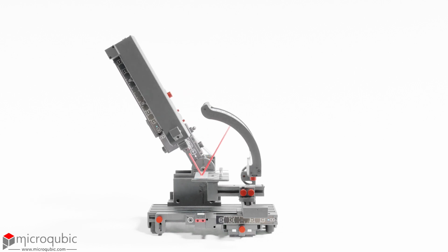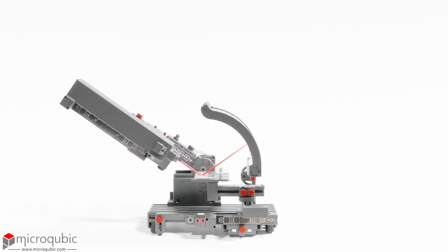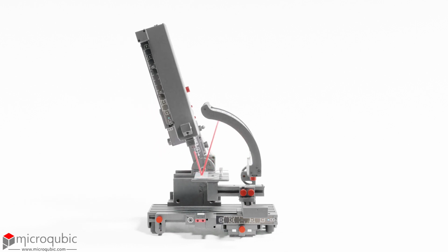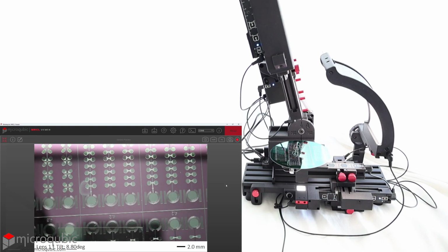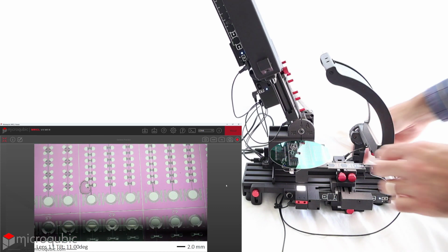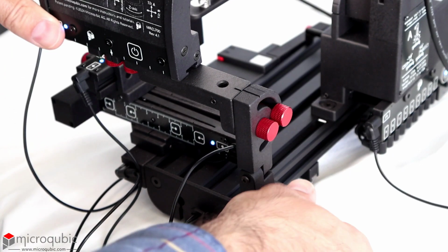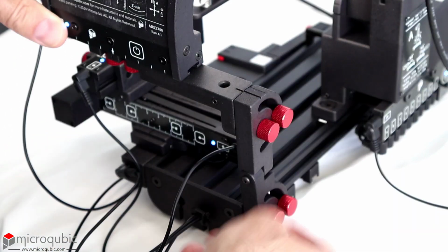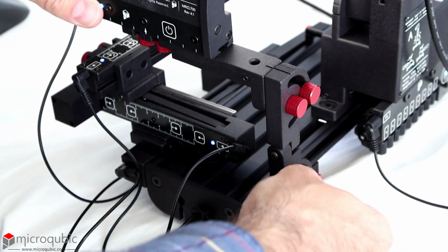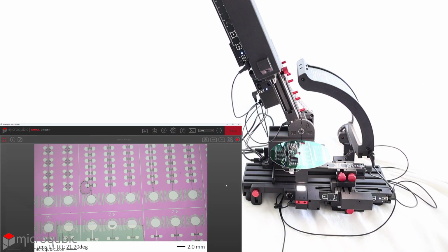Begin with at least a 10-degree camera tilt, position the curved illumination, and then you can tilt the camera all the way to 90 degrees without needing to reposition the light. For example, here the light is initially not correctly positioned, resulting in darker areas on the sample. You can adjust the light source using the articulated arm until the entire sample is illuminated with diffused light, without being shadowed by the camera.